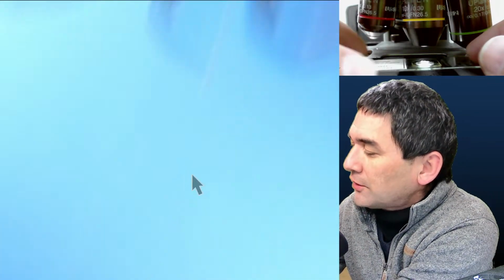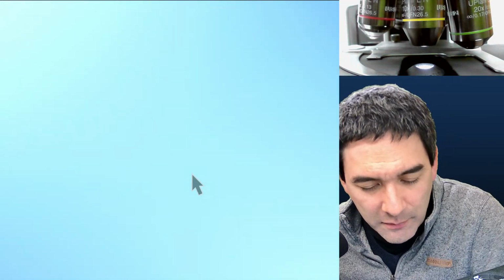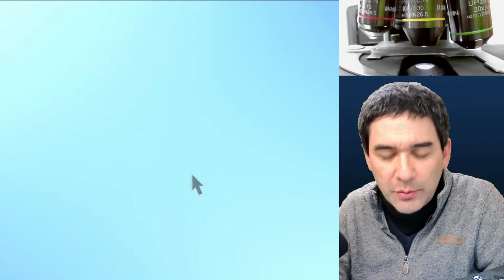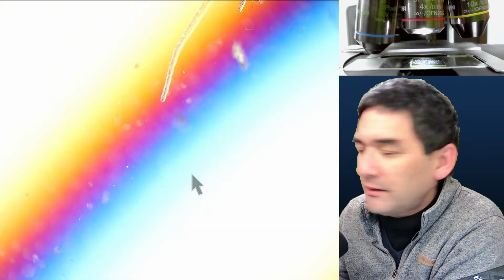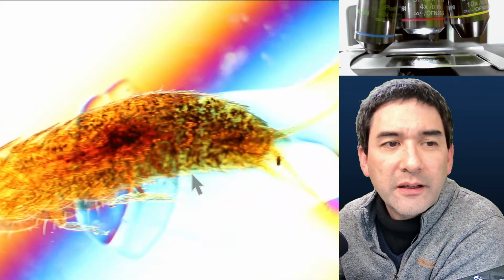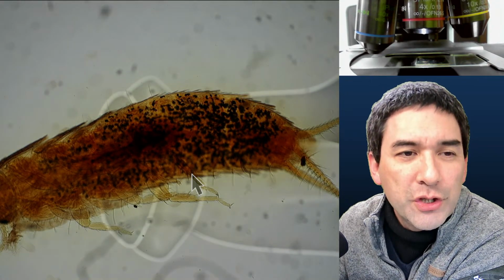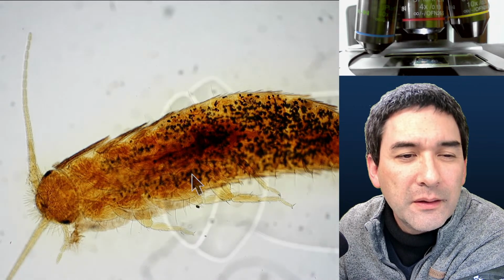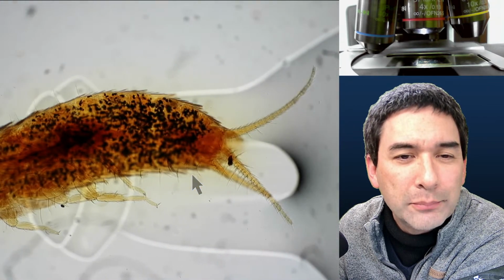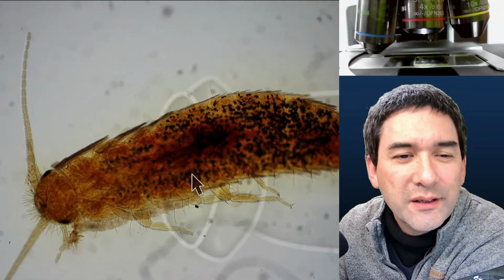Okay, so I just also wanted to show you now. Let's move on. I'm still with my homemade slides here. This one over here is a fairly large one. I wonder if you're able to recognize it. This is a pretty bad preparation, because of its thickness the mounting medium already started to form bubbles and to separate. Maybe you can see that a little bit here.